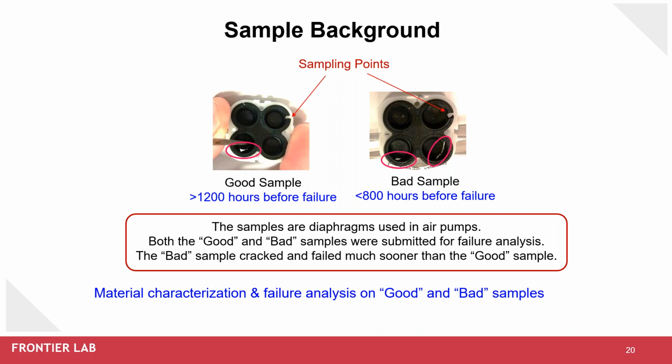So the same part number at a point in a supply chain can result in a polymer part that is not made with the same formulation, but the apparent polymer properties may seem to be the same. So after usage by a company or customer, a failure analysis may be required to identify the detailed chemical composition of the products.